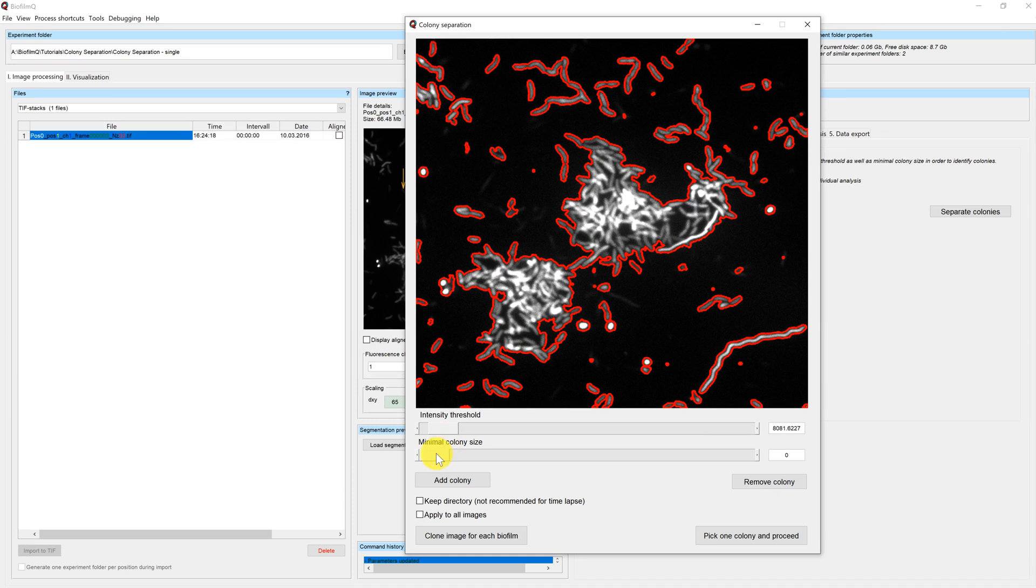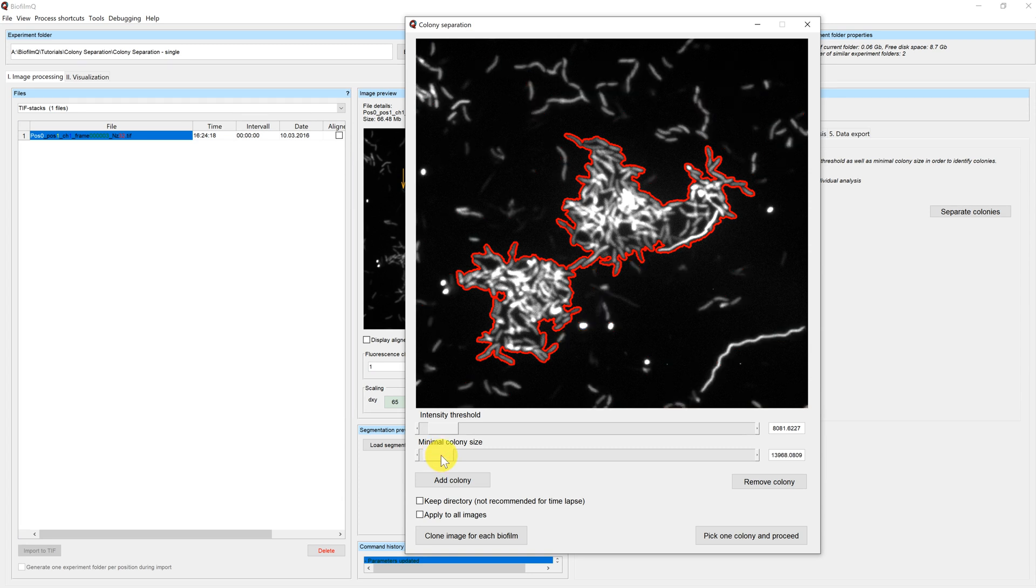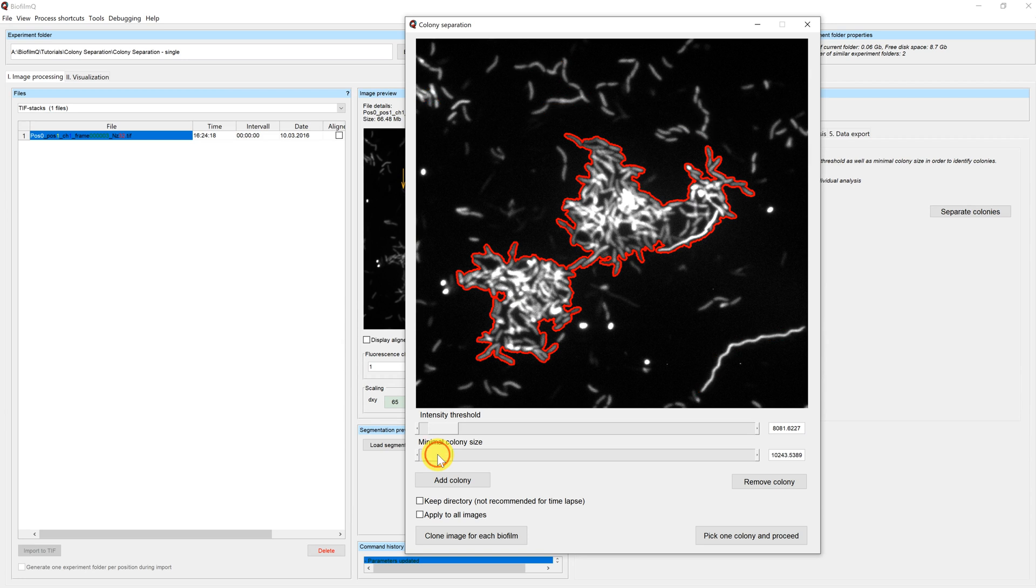The lower slider adds an additional threshold for the colony size. At the moment it is set to zero. That means that all pixels which are brighter than the intensity threshold are part of the current selection mask. If we move the slider to the right, small selections will disappear.